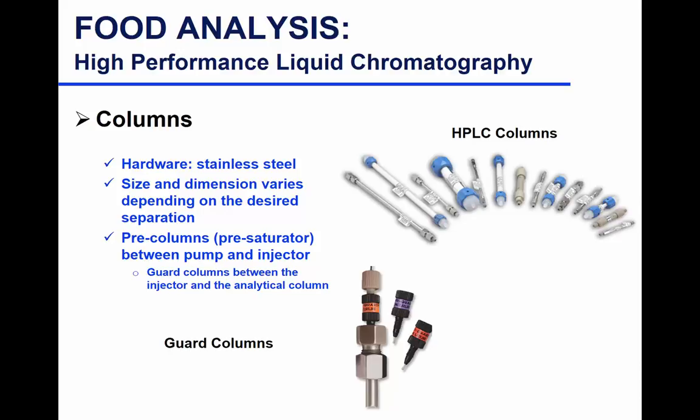They're very sturdy, but if you drop it, the stainless steel is not going to break. What's going to break is the stationary phase that is packed in there, and it's going to break beyond repair. So you would say goodbye to an $800 column. Sometimes it's a $1,500 column. So you have to be very careful with it.